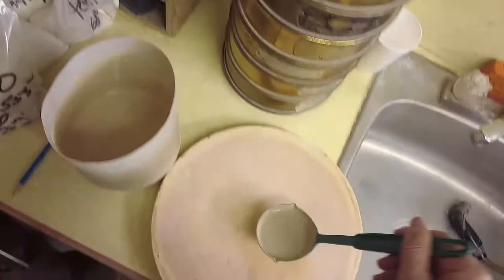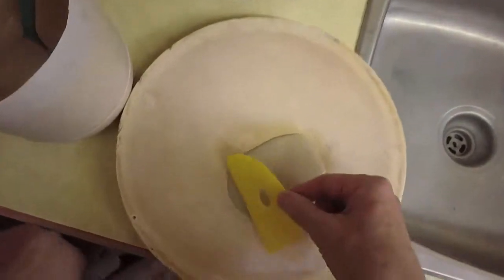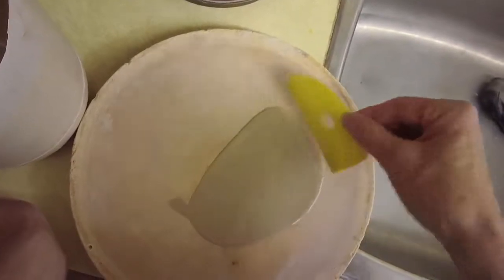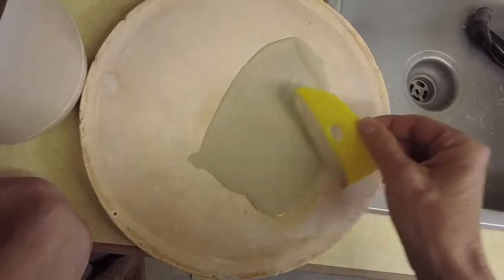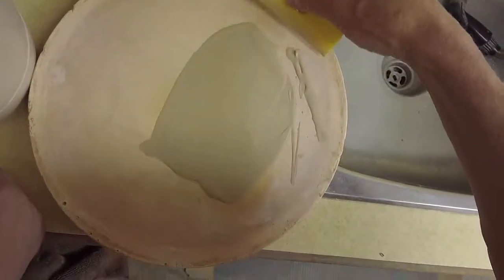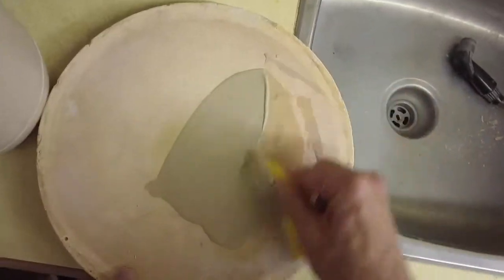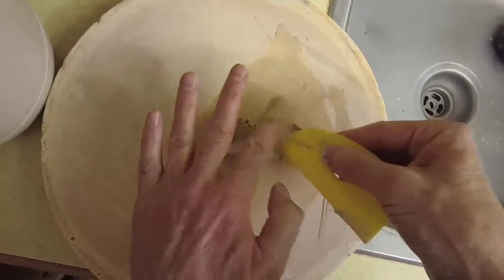This glaze is fairly well gelled. I'll pour it on my plaster bat and just spread it out. A typical glaze that has the right amount of clay in it — not too much Gerstley Borate — will dewater on this plaster within seconds, so I can scrape it up and spread it back out again.